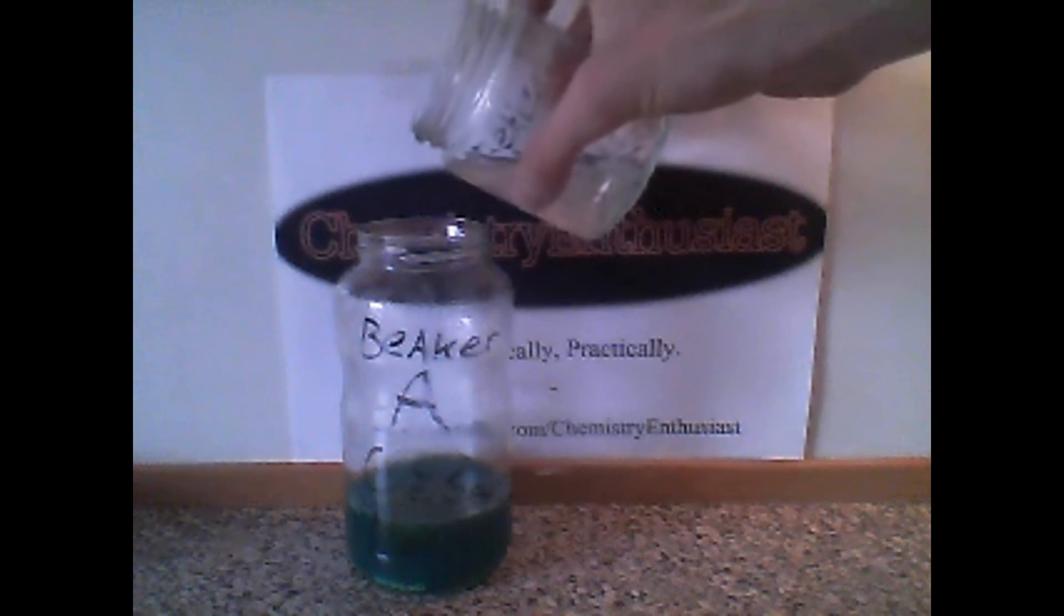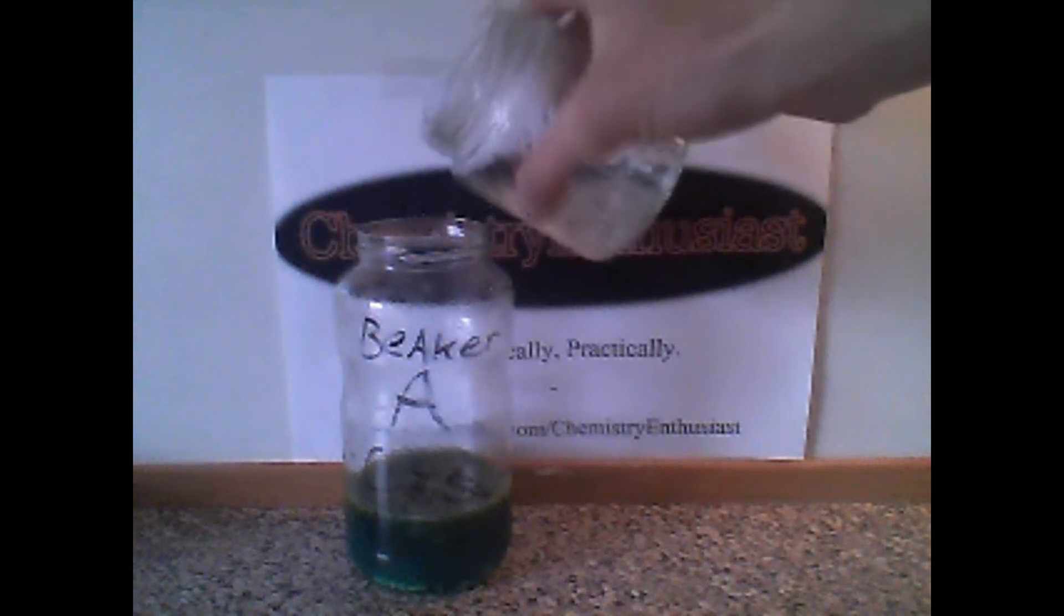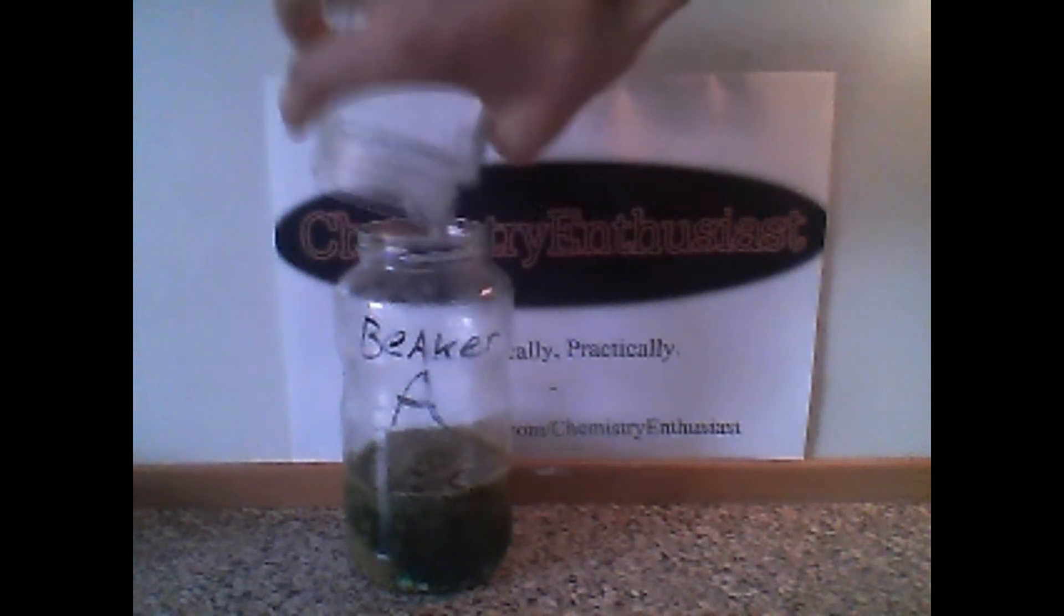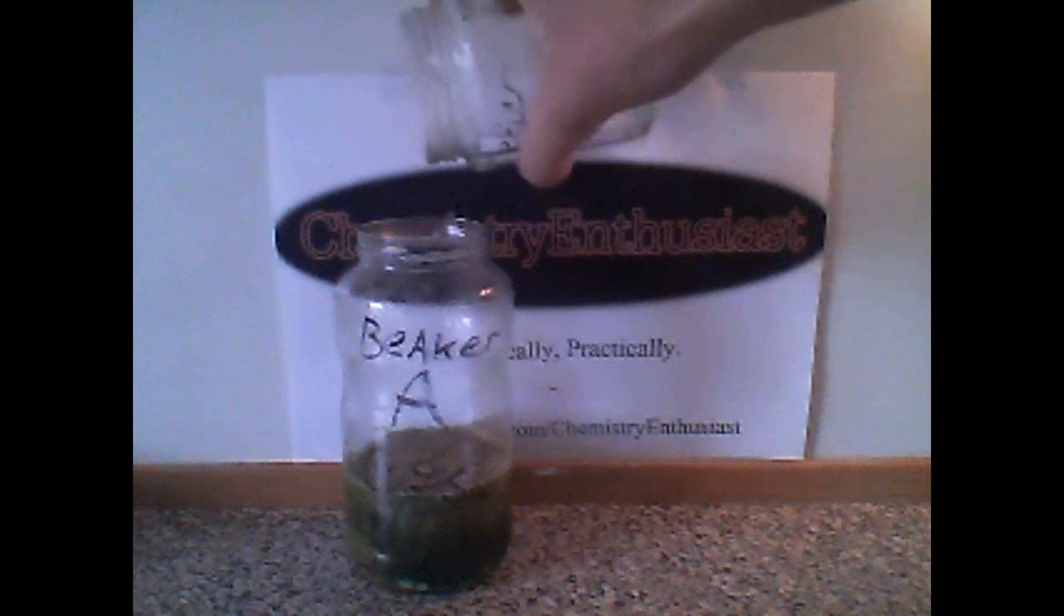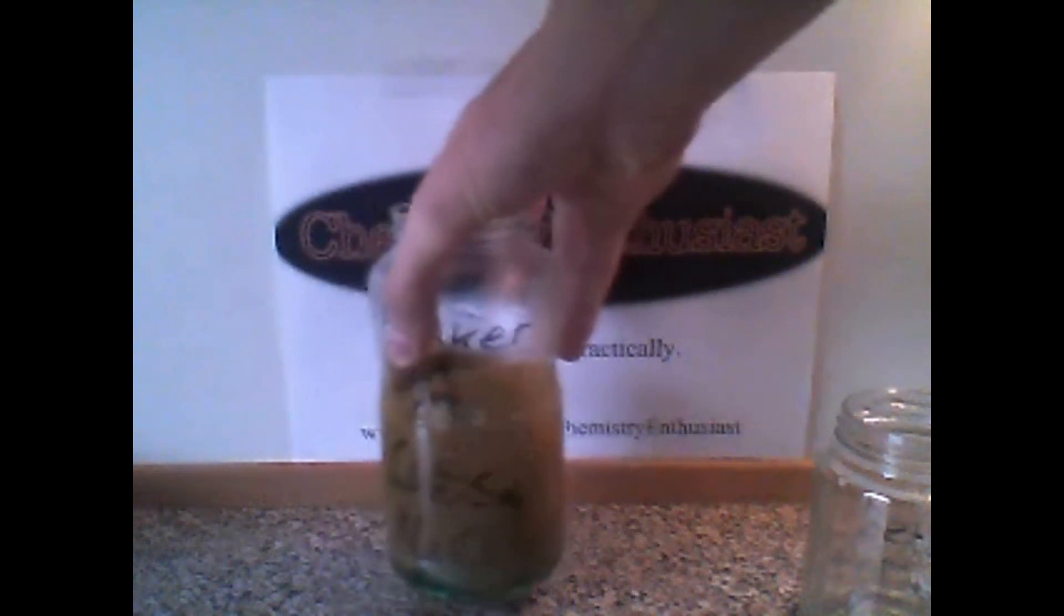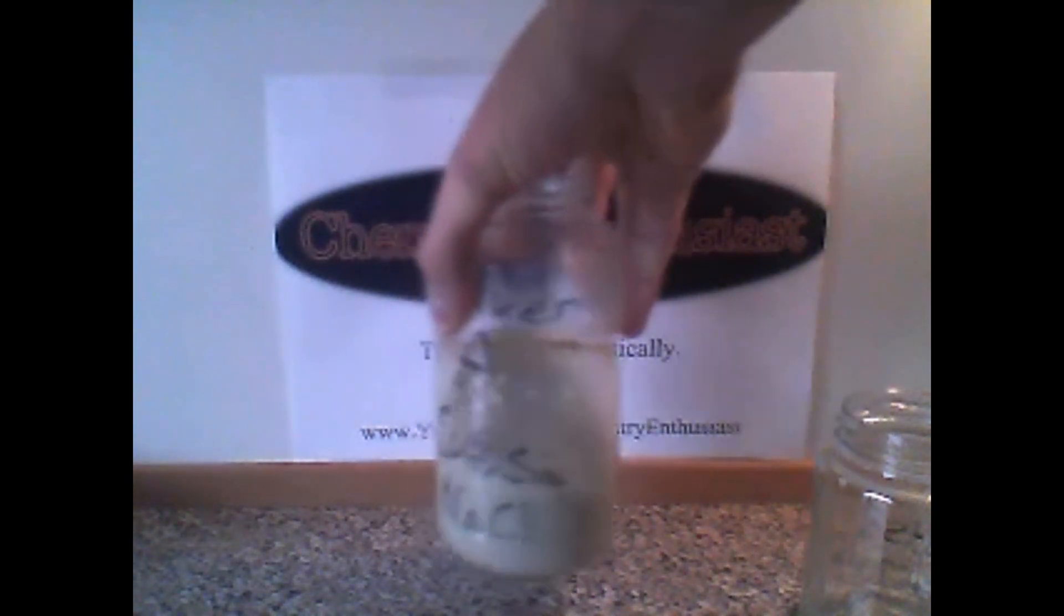This should be under fume hood or outside. A brown precipitate will form. This is copper hydroxide. But when you stir it around and all the chemicals are reacting, it will turn into copper chloride.